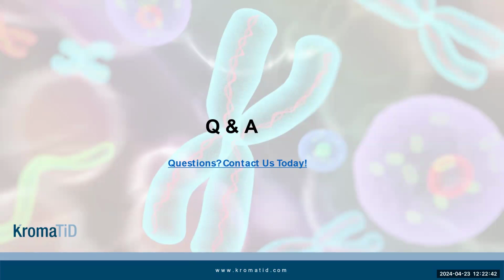So the next question deals with distinguishing between homozygous and heterozygous variants. This kind of dovetails a little bit on the question that Erin just answered, which is that direct visualization of chromosome abnormalities that are specific to individual chromosomes can be distinguished because it's direct visualization, because it's single cell. There's no mingling of DNA from different cells, and there's no averaging out of low prevalence variants or anything like that.